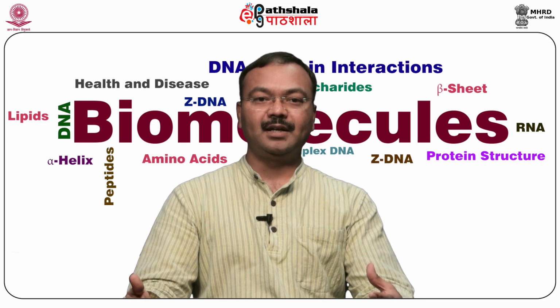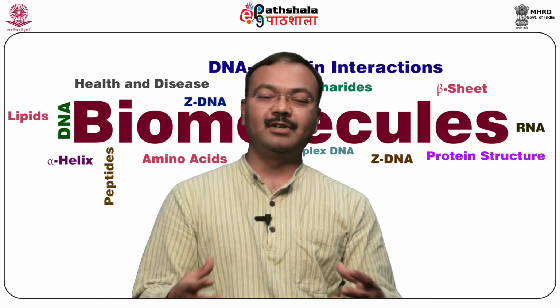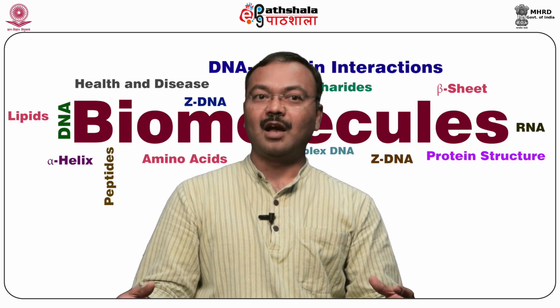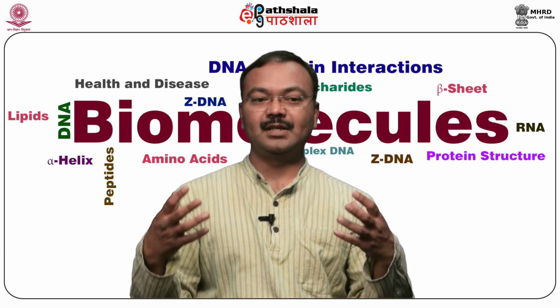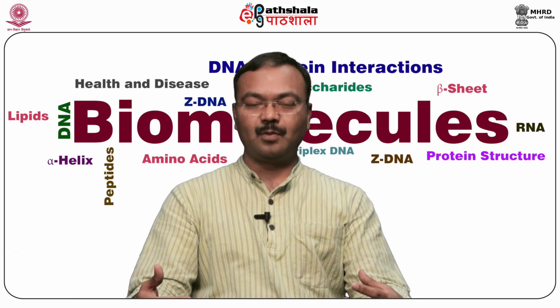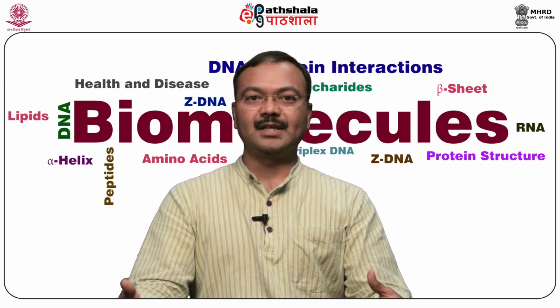And most importantly, seeing is believing. How many of you have seen several movies where the judge asks, have you seen it? So the perception of seeing is considered as believing. Now I will start talking about a few methods. The first example is X-ray crystallography.